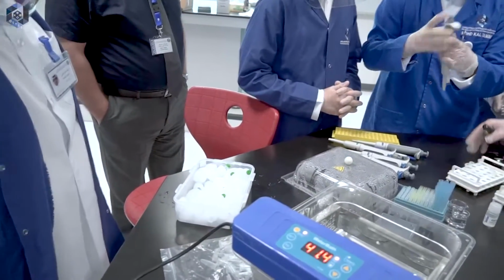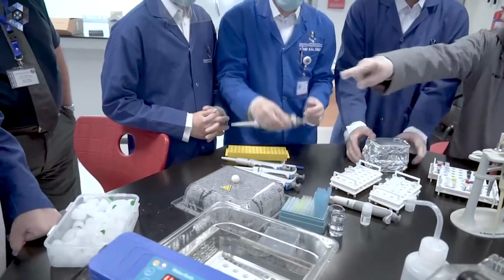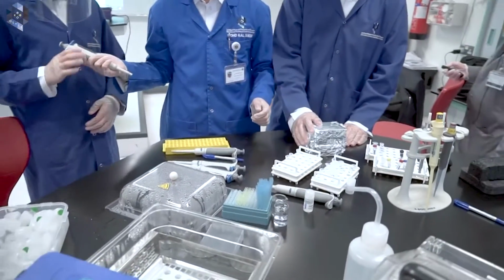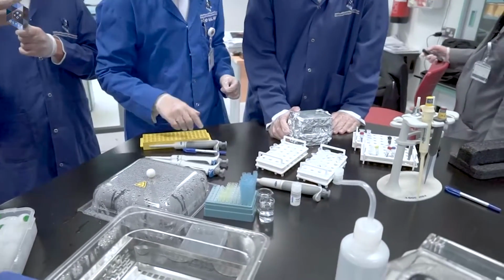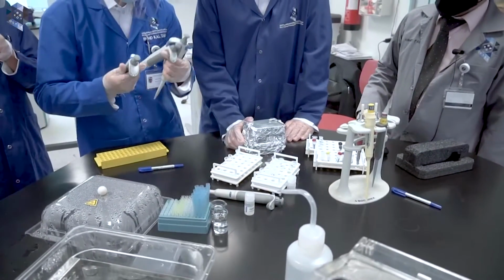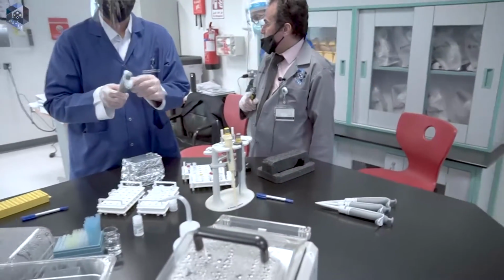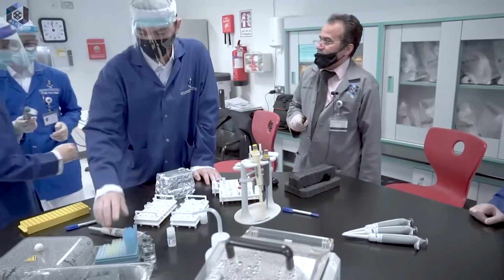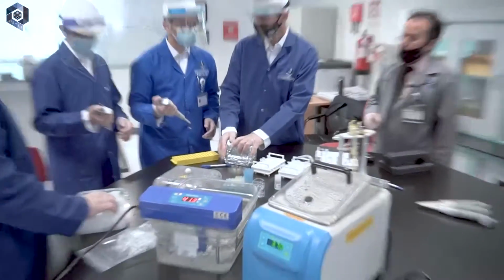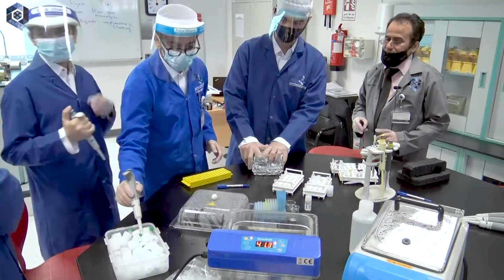Now the next step, you will transfer 250 microliters using the sterile tips from the liquid broth to the microcentrifuge tube. Okay. 250 microliter ready? When it beeps, when the time ends, start. Use the sterile ones. Yes.